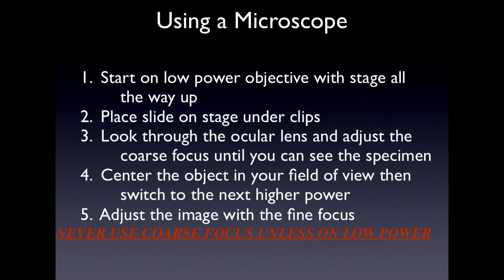When you switch to the next higher magnification, you're going to adjust the fine focus. Remember that you should never touch the coarse focus unless you're on low power magnification. Once you've adjusted the fine focus, if you need to go to a higher magnification, you can repeat steps 4 and 5, centering the object and then switching to the next higher power and using the fine focus.